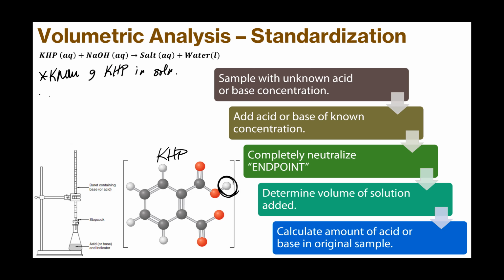Okay, we're going to titrate this with whatever base we're using. In this example, we're using sodium hydroxide. Okay, titrate this with base. And then from there, we can figure out what the base concentration is.